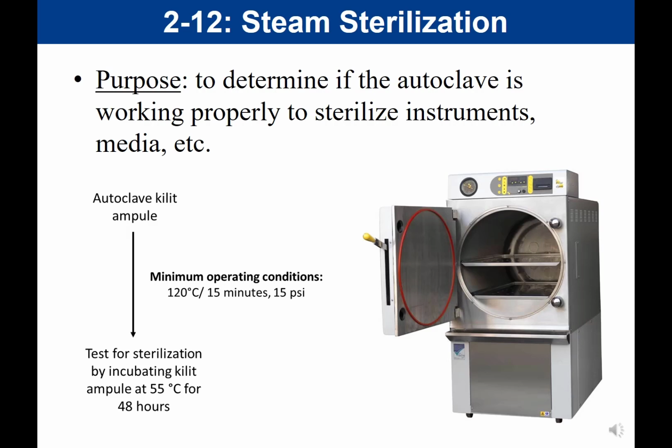And two, it also is there to help sterilize the agar. And the reason for that is, remember that nutrient agar is a nutrient-rich media. If you don't sterilize that nutrient agar, and then you inoculate that plate and you put it in the incubator, anything that was in the agar would grow. And so if we want to do experiments, we need to make sure that our nutrient agar is sterile so that when we inoculate it, the only thing that grows is what we've inoculated onto the plate.